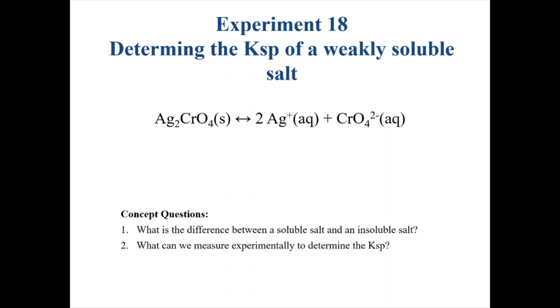In this video, we're going to look at experiment 18, which focuses on determining the KSP of a weakly soluble salt. This is actually something we've been doing in our virtual lectures while you guys are in lecture, quote unquote. So if you have any questions about KSP, you should review the video titled "Determining the KSP from the Equilibrium Concentration," or determining KSP from concentration values, because essentially this experiment is exactly that.